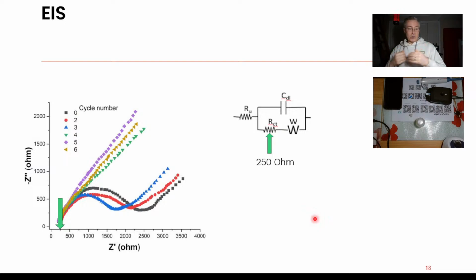But in my world, because the gaps are small, the solutions are quite conductive, and the currents are small, actually we don't have a big IR problem. But I can understand in more higher currents, larger electrodes, less conductive materials, then you do have a problem, and the raw signal will suffer from this IR drop.